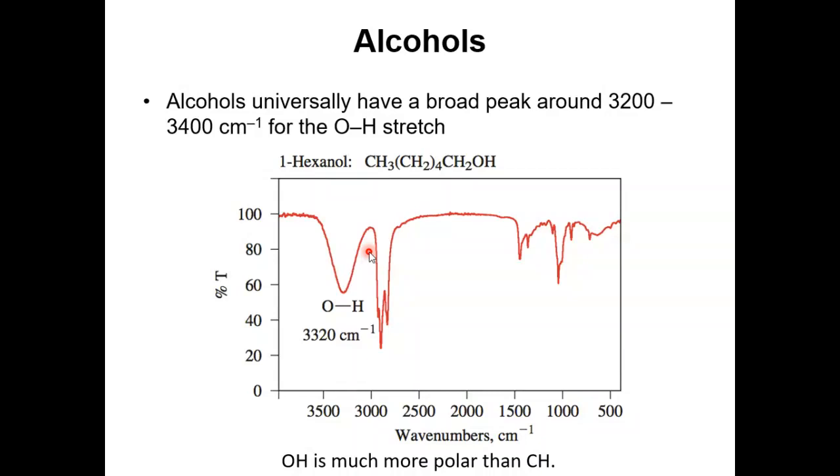Anyway, this is one feature. If you have an OH group in the molecule, you will never miss it. It should give you an intense infrared peak, and generally broad. This is going to be very useful when you do your unknown in organic lab. If you have an OH group, you should never miss it. It should be an intense and generally broad peak.